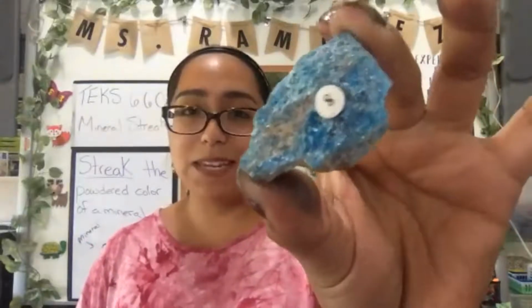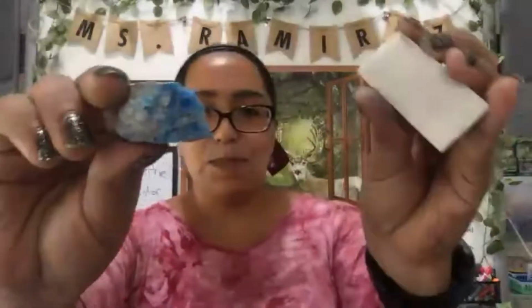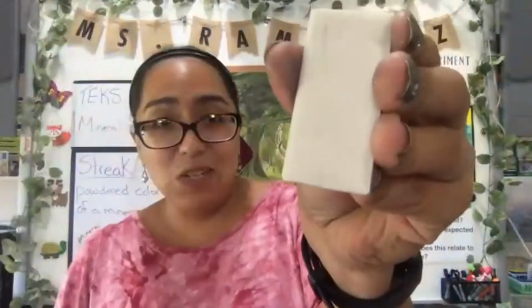My next one we're going to try is this pretty blue mineral. This one happens to be the blue variety of apatite. And what color streak do you think it might have? So I'm going to take my streak plate, rub it across, and notice that I can't see anything. Most people think that when they see this one, it's going to have a blue streak. But again, we know that that's not always the case. The streak color and the mineral color can be different.